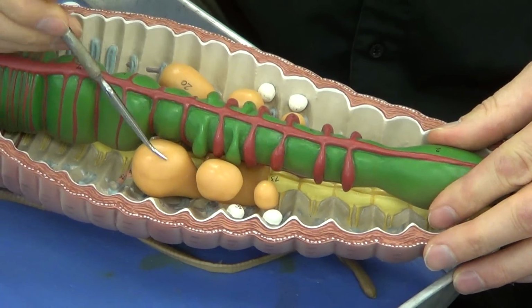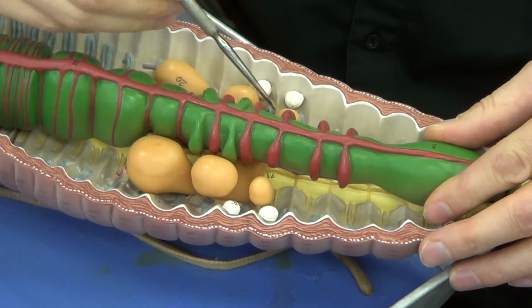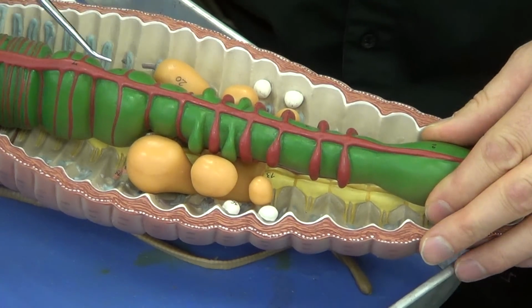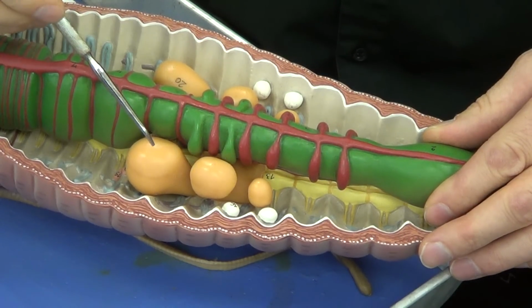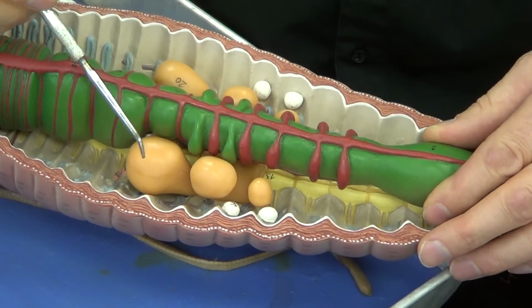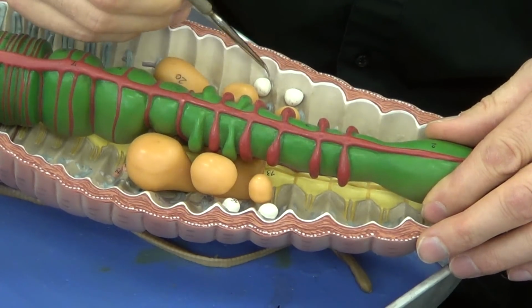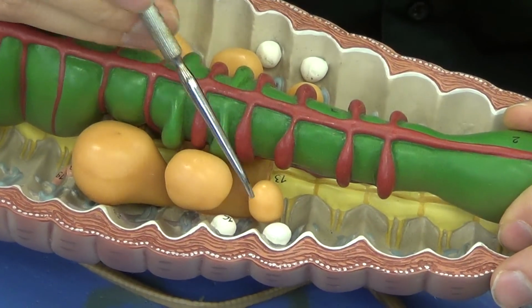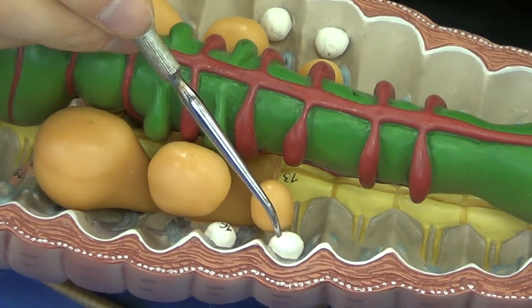And you can see 2 cream-colored organs on either side. These cream-colored organs are going to be called the seminal vesicles. And their job is to produce sperm that will be used to fertilize the eggs of another earthworm. And down here we have smaller structures, going to be similar in color, maybe a little bit whiter, but similar in color. And those are going to be your seminal receptacles.